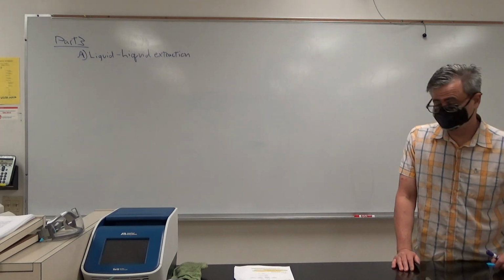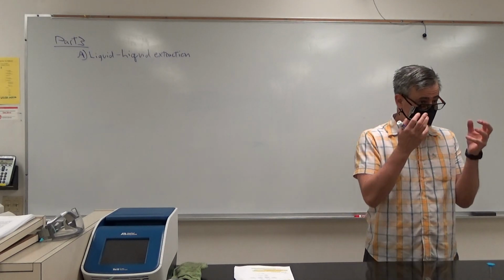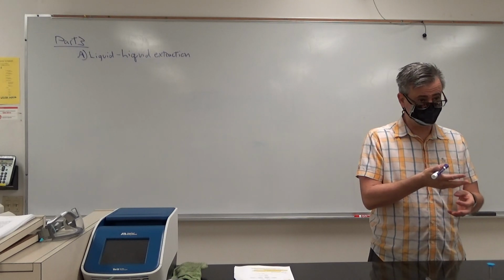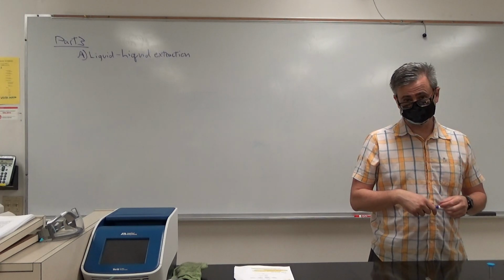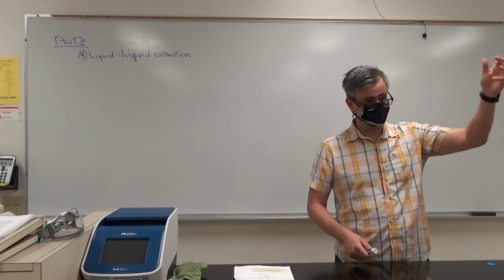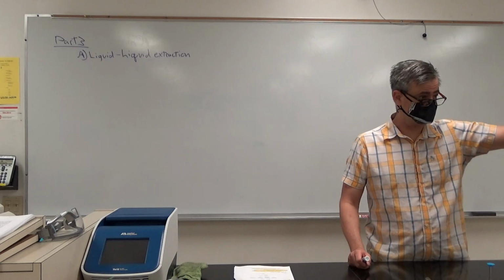Okay, so in a liquid extraction, what you're going to do is mix two immiscible solvents together, okay? Immiscible means they don't mix. They make two different layers. The visual I always suggest is Italian dressing when it's just sitting on the shelf in your refrigerator. Yeah, it's got two different layers.